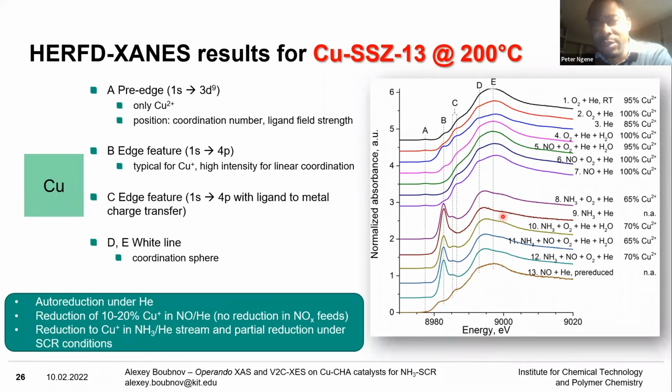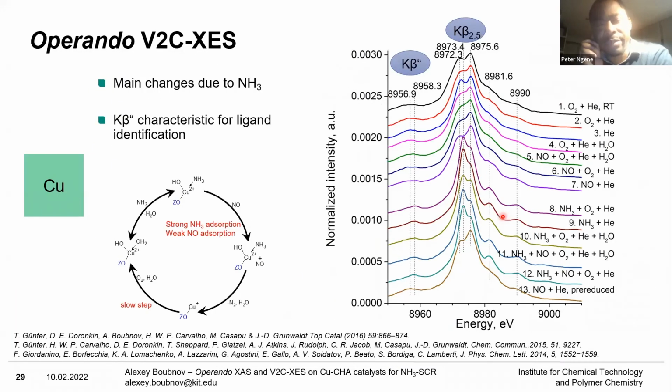But here, at this temperature, you basically only reported copper, that is nitrogen adsorbed on copper, and then copper plus. And so I was wondering if you also looked at the possibility of copper nitride, a real bond formation between nitrogen and copper. So there is interaction between nitrogen and copper, but this is nitride, you mean Cu3N, yes. Right?